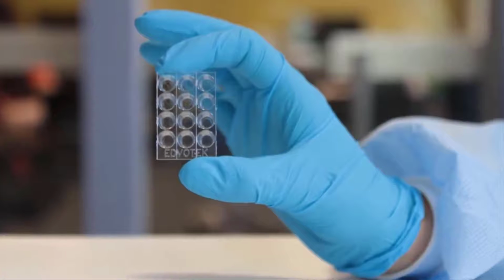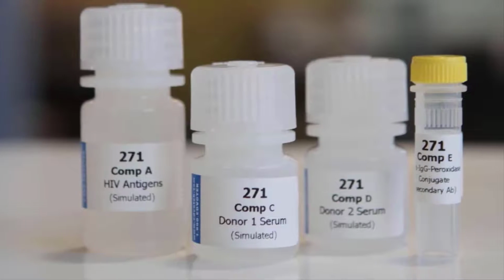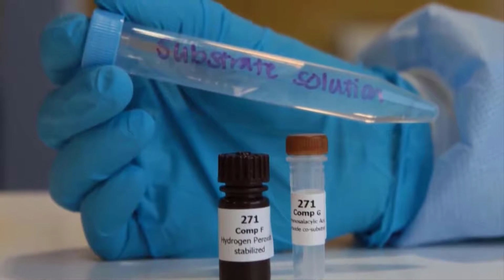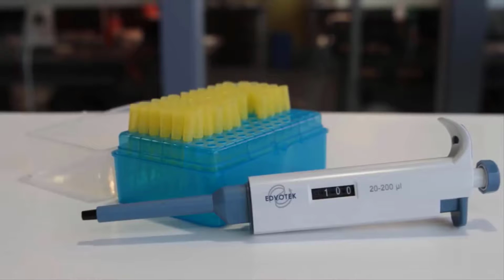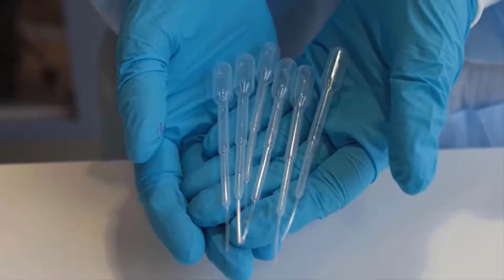For this experiment, you will need a microtiter plate, phosphate buffered saline, antibody and antigen samples, a color-changing substrate solution, a 37-degree incubator, an adjustable micropipette and tips, and transfer pipettes. Step 1.